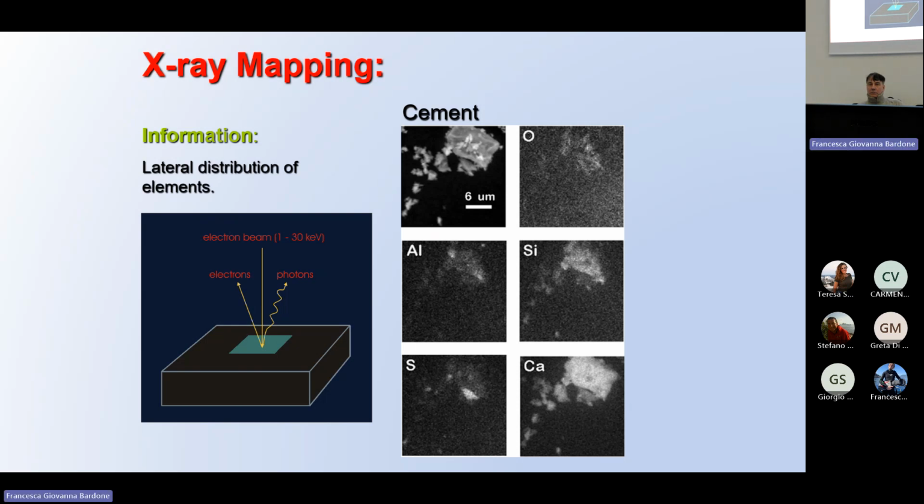The aluminium is maybe more concentrated in one side, but there are other pixels with the aluminium also in the southeast corner, southwest corner. So what does this give you? If there is no quantitative data there, what does it give? I can say, if just qualitative, just put the point there, all overlap.